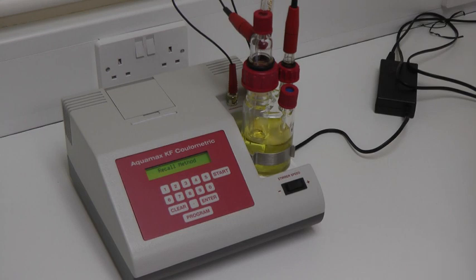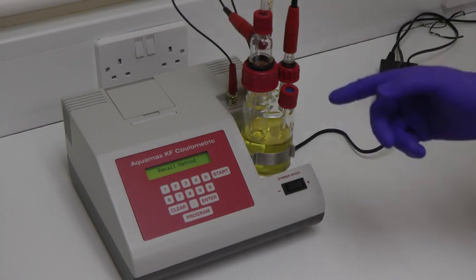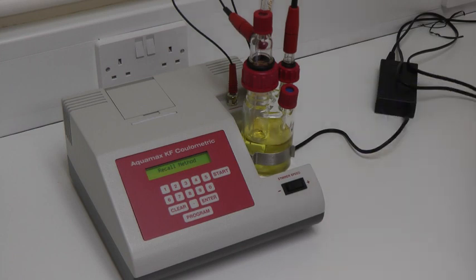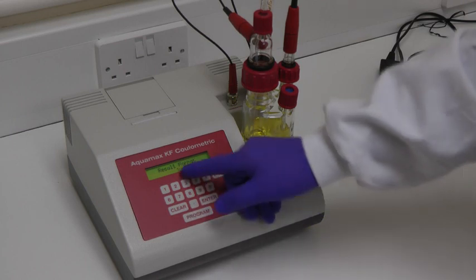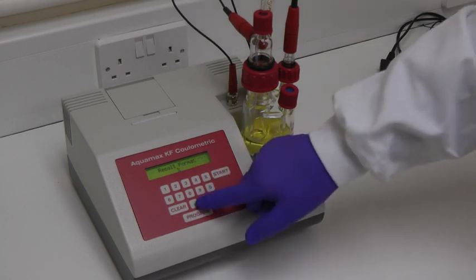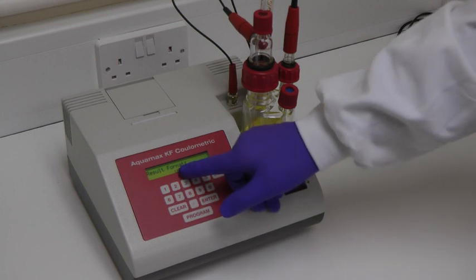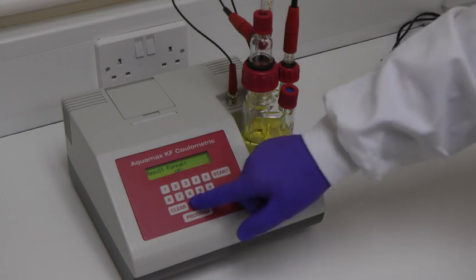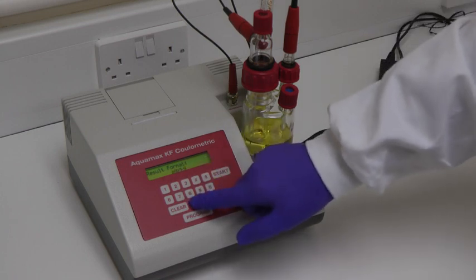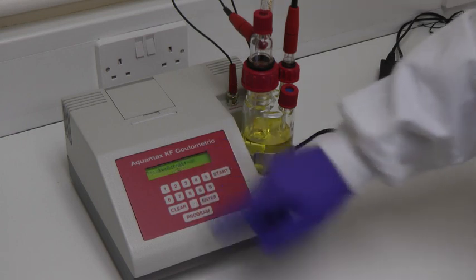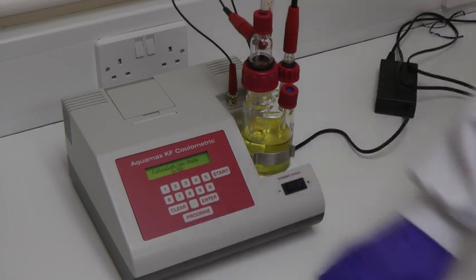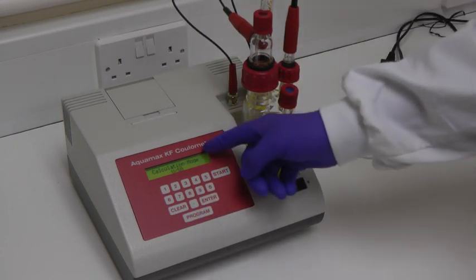The second parameter is Recall method. Methods can be stored in memory to avoid reprogramming from scratch. The next parameter is Result Format. Pressing the decimal point will cycle the format through microgram, ppm, milligrams per kilogram, and percentage. Press enter to select the required format, and then enter again to move to the next parameter.